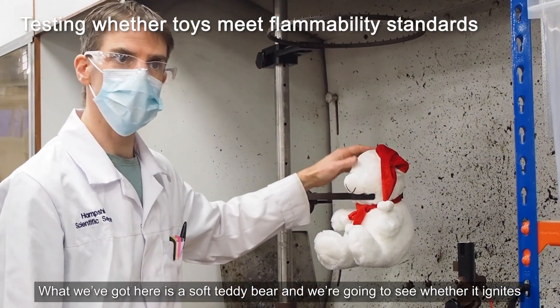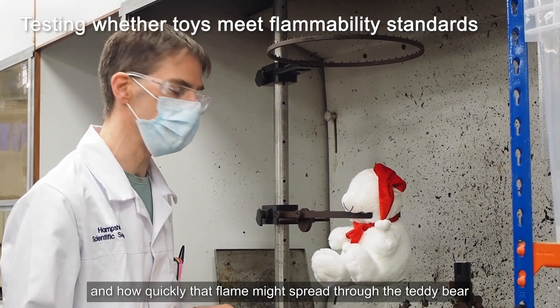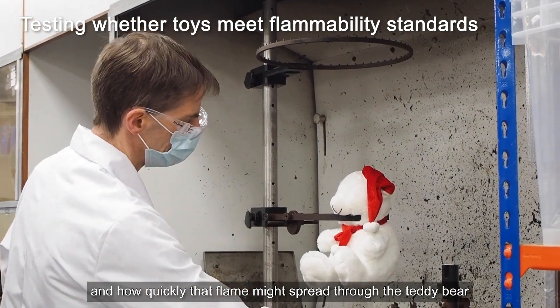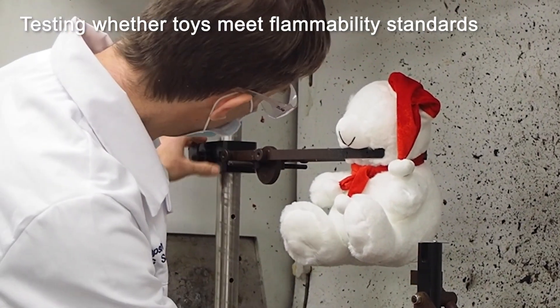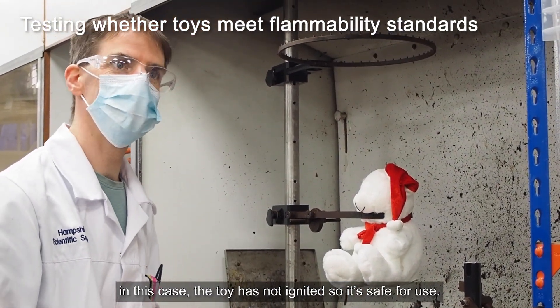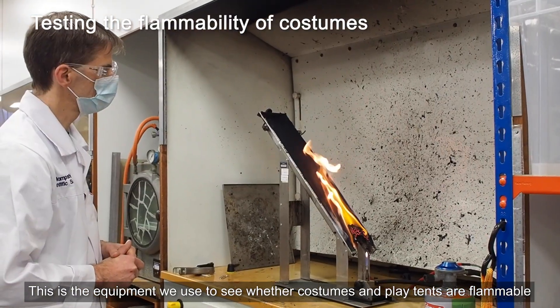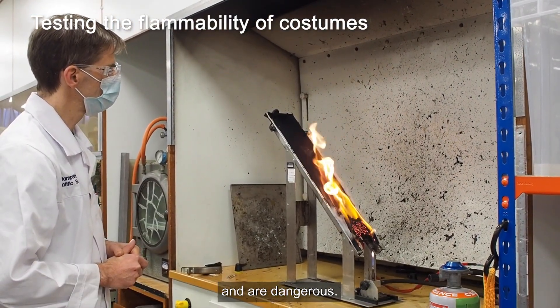What we've got here is a soft teddy bear and we're going to see whether it ignites and how quickly the flame might spread through it. In this case the toy has not ignited, so it's safe for use. This is the equipment we use to see whether costumes and play tents are flammable and dangerous.